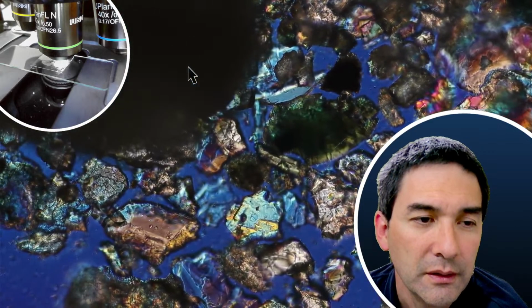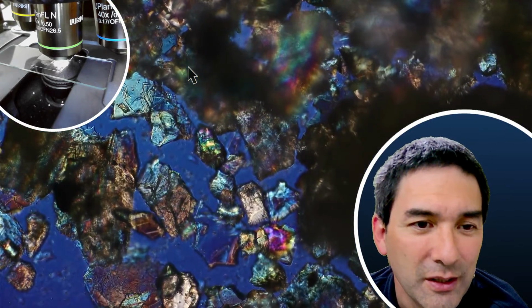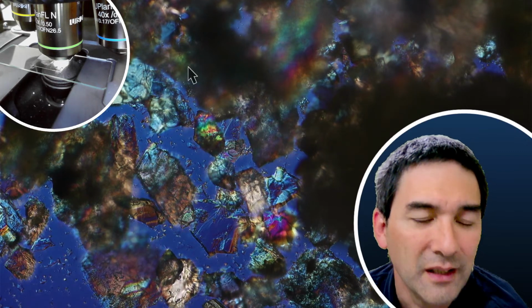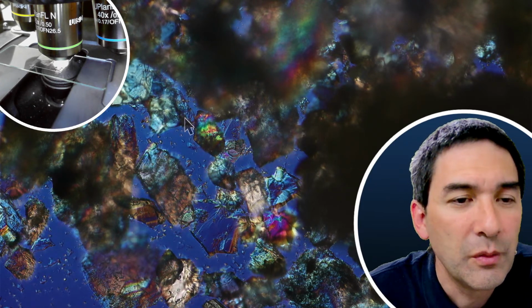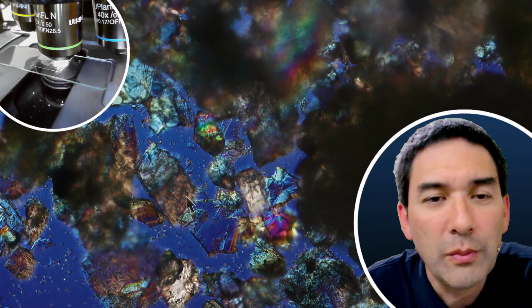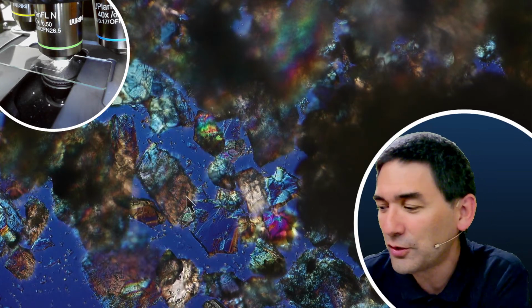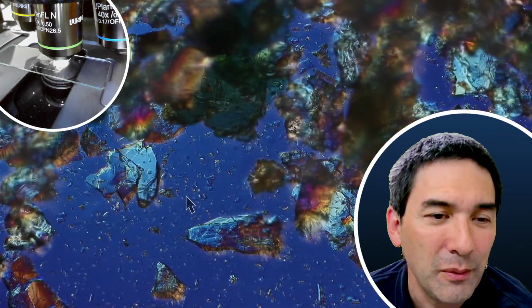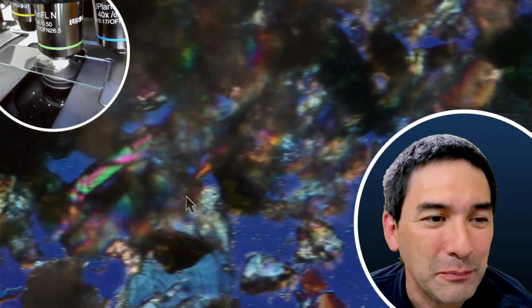I'll be very honest now, the reason why I collected this sand is that, oh, there's a little bit of movement going on here. Do you see? Maybe you're able to see this tiny cell. This is definitely not Brownian motion. This one was way too directed, but somewhere over here now it's not visible anymore. The reason why I collected the sand sample is because it's been said that there are small amounts of gold in the sand. So I was hoping to find a little bit of gold here, but you'd have to separate the gold from the other material.